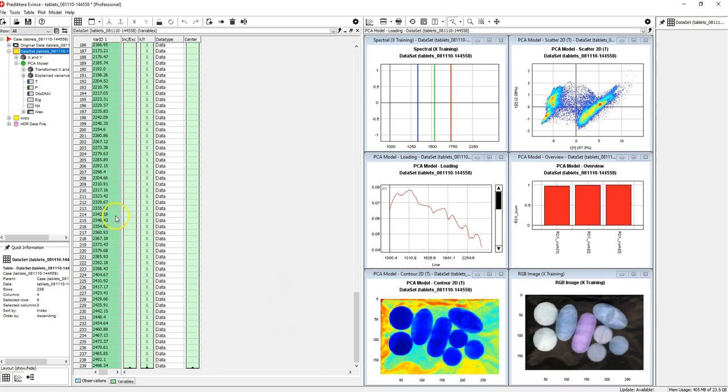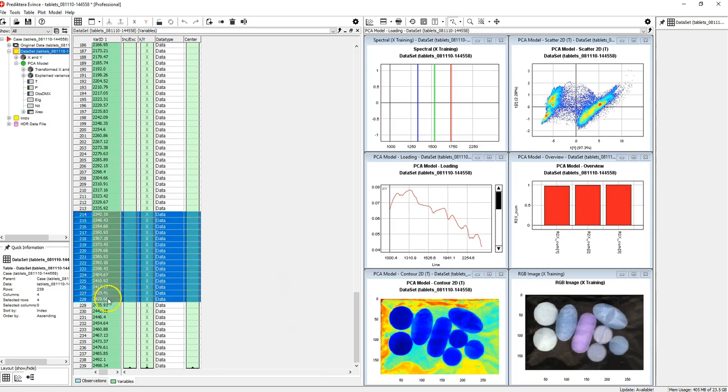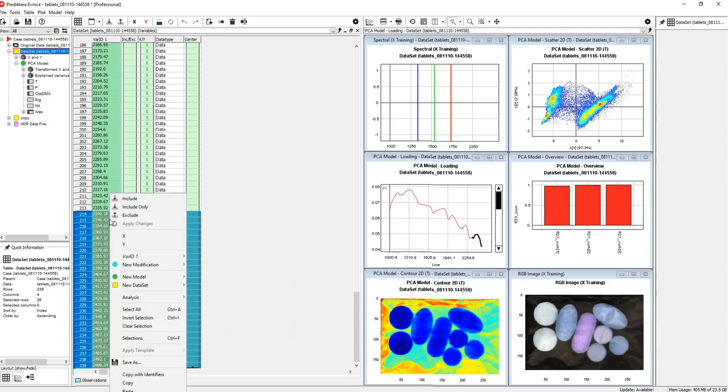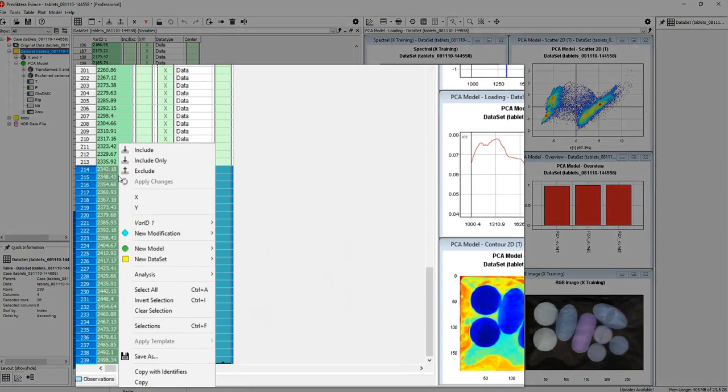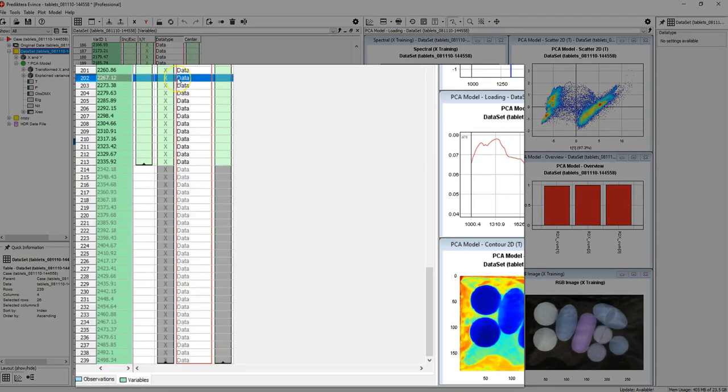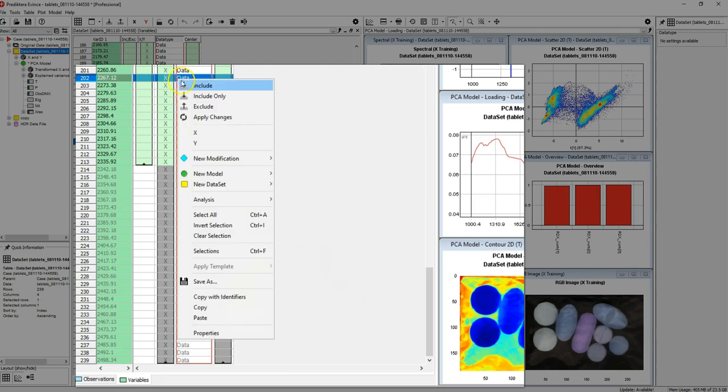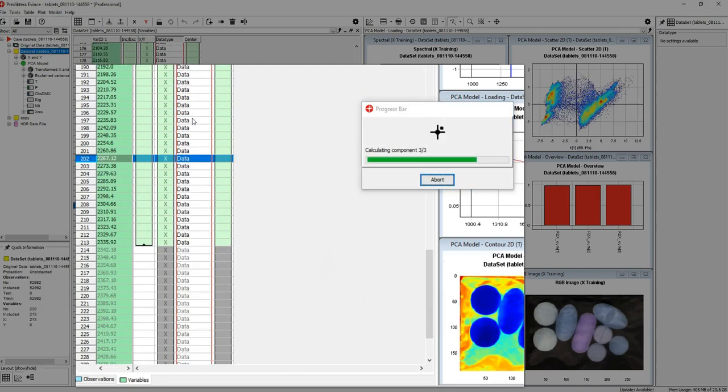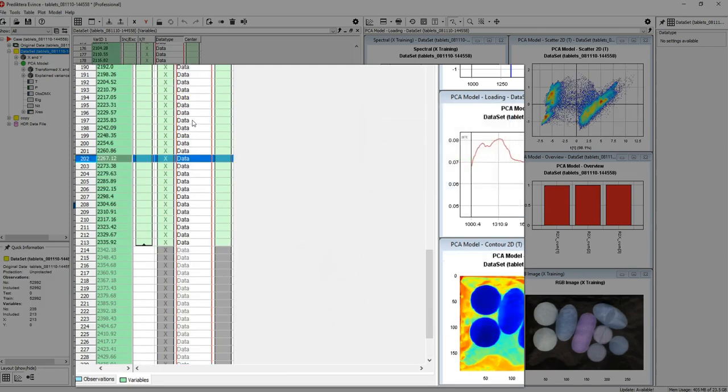Hold down the left mouse button to make a selection, and then right click to access the menu to make modifications. For example, to exclude variables or to add spectral transformations.